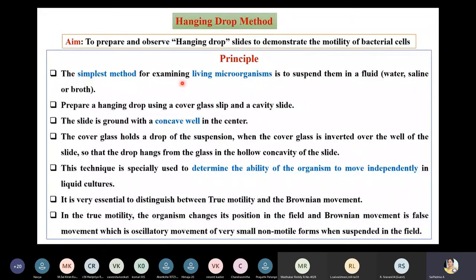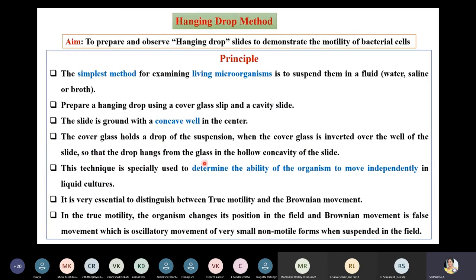The simplest method for examining living microorganisms is to suspend them in a fluid, which can be water, saline, or broth. A hanging drop is prepared using a cover glass slip and a cavity slide. The slide is ground with a concave well in the center. The cover glass holds a drop of the suspension, and when inverted over the well, the drop hangs from the glass in the hollow concavity of the slide.